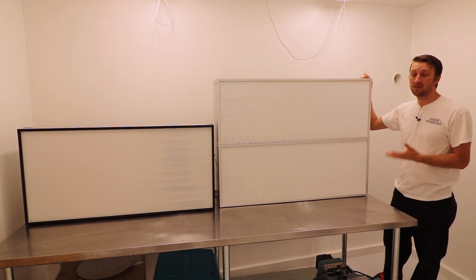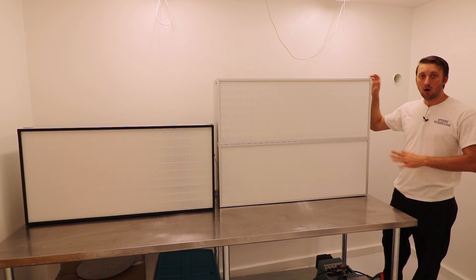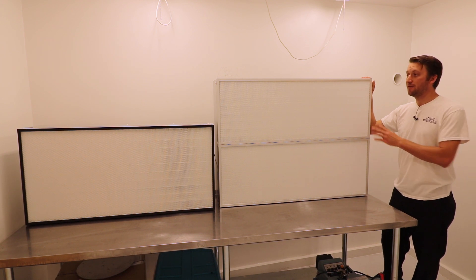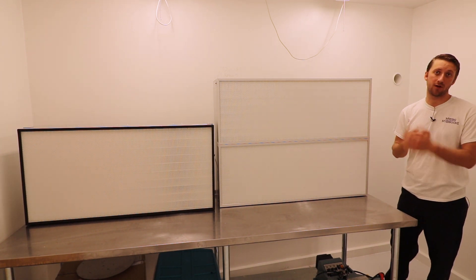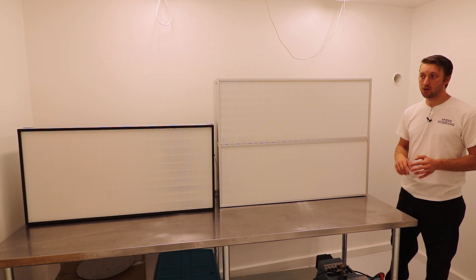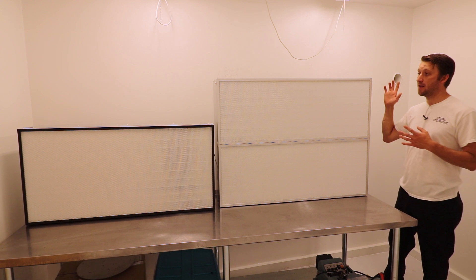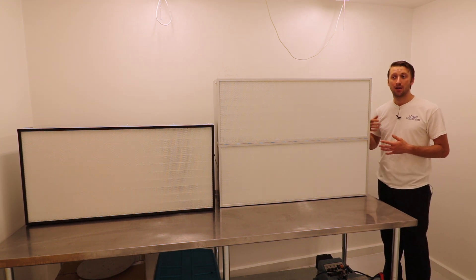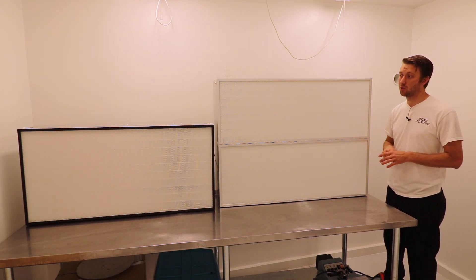Depending on your environment — if you're in a small lab that's clean, sealed, no carpets, not very dusty — the filter will last a long time even without the pre-filter and you'll get a little bit more flow, scrubbing the air quicker. If you're in a basement or garage or some dirty, unsealed environment, you're going to want to run your pre-filter and change it often to keep your flow rate up and save your primary filter from clogging.